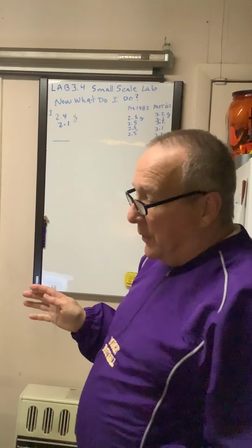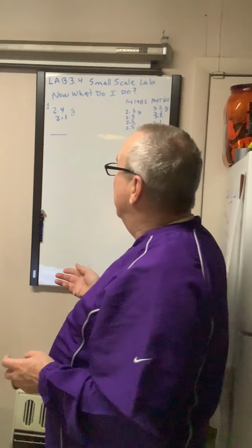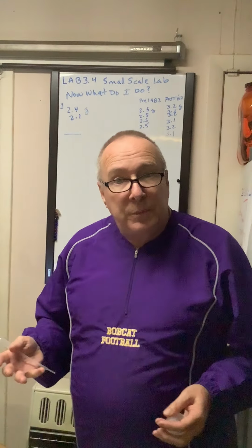I want to do another lab with you today. It's lab 3.4. You'll find it posted in the course stream and in your course assignments. This lab, again, involves measurements and density and just reviews some simple concepts and gets you familiar with measurements and working with density.